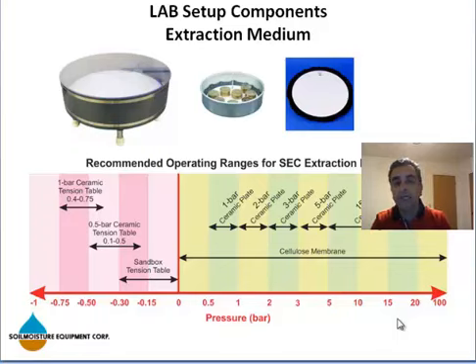Here, let me explain a little bit about high flow and standard flow options. Sometimes people ask, Soilmoisture has 1 bar standard flow and 1 bar high flow. What is the difference? Well, the difference is the flow rate. 1 bar high flow has 10 times more flow rate. Now the next question is that, then why should I use a standard flow? The answer to that question is that, well, oftentimes you don't have to.